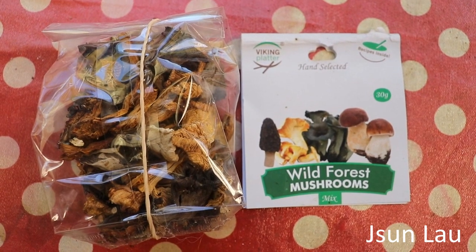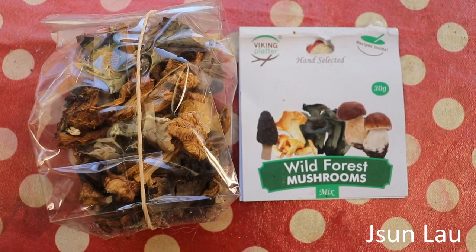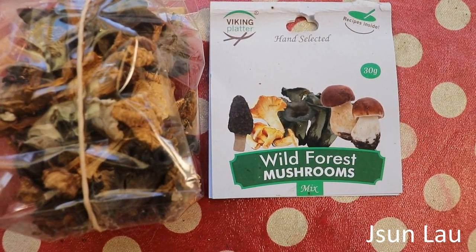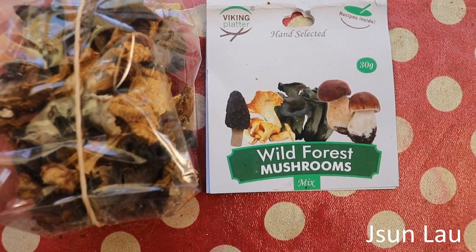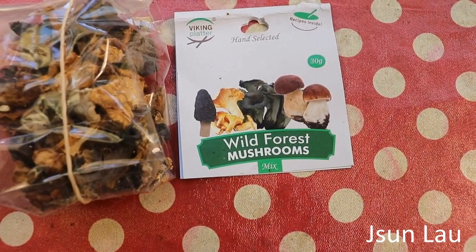These are a packet of mixed dried mushrooms I've bought — they're from Serbia. They've got morel, chanterelle, black trumpet, and bossini. There are only two morels in there.